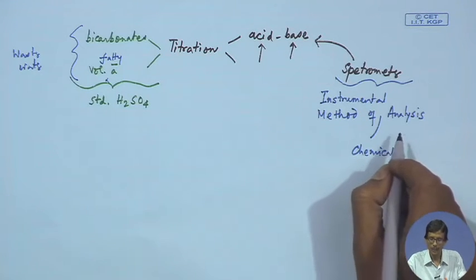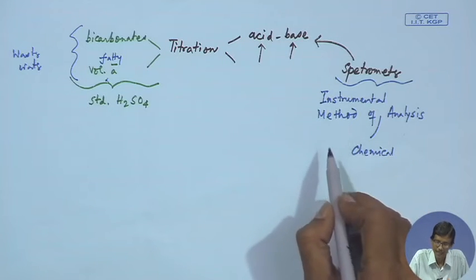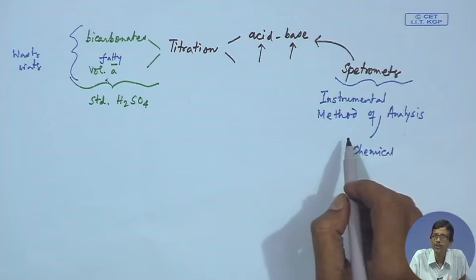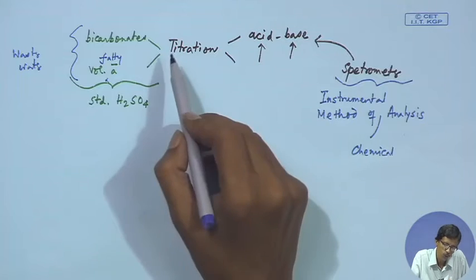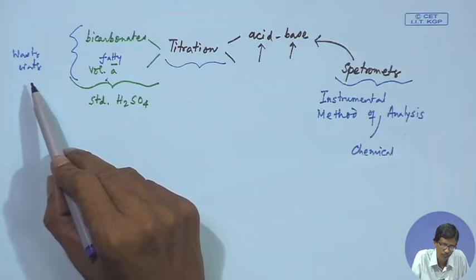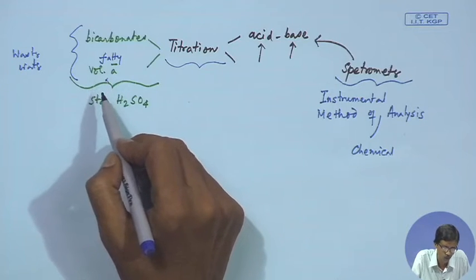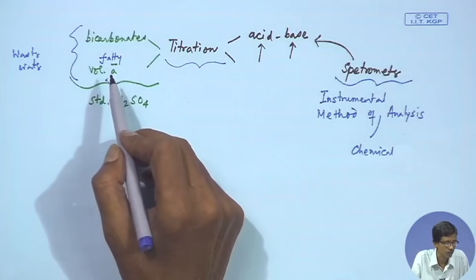That is a huge area of interest, and that can itself be a separate course where we can talk about the corresponding instruments, but in this particular course I will try to introduce some basic aspects of all those instruments and how we can design. If you know what your problem is, because the problem is how you treat the wastewater and how you decompose the wastewater to get two components, and we want to analyze the concentration of those analytes in terms of the fatty acid concentration and the bicarbonate concentration.